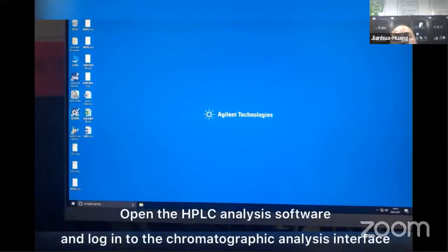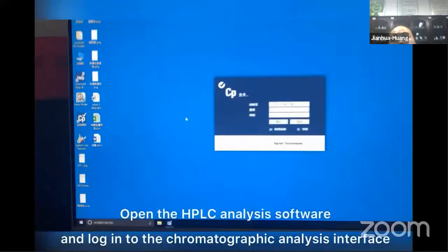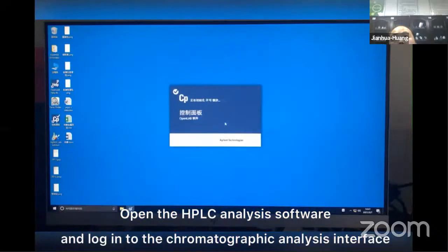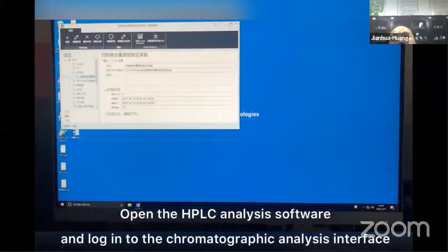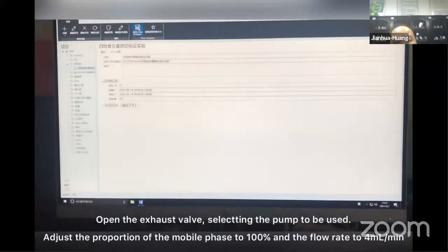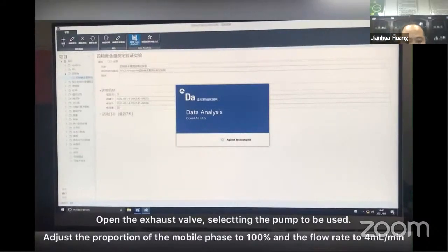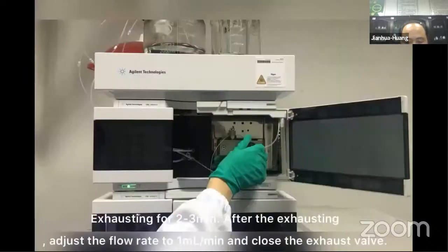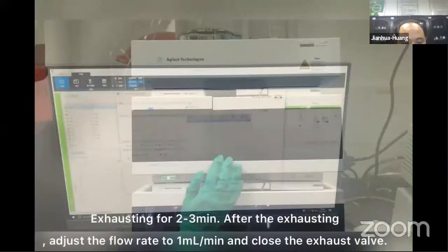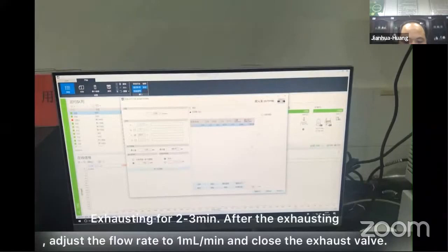Open the HPLC analysis software and log into the chromatographic analysis interface. Open the exhaust valve, selecting the pump to be used. Adjust the proportion of the mobile phase to 100% and the flow rate to 4 milliliters/minute. Exhaust for 2-3 minutes. After the exhausting, adjust the flow rate to 1 milliliter/minute and close the exhaust valve.